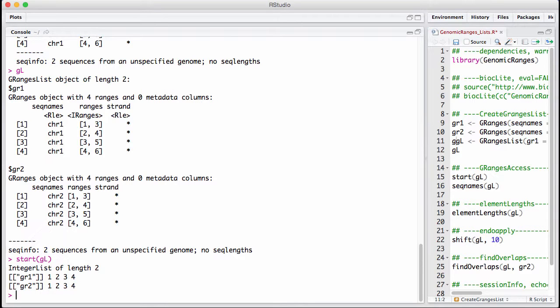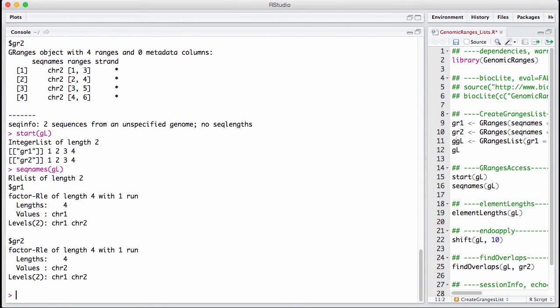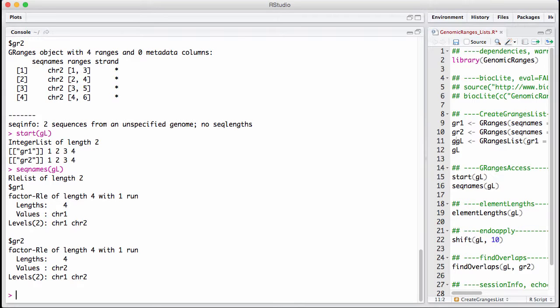In the same way, we can do seekNames and so on and so forth. It's very appealing to think about using things like LApply and SApply, and that's very worthwhile.